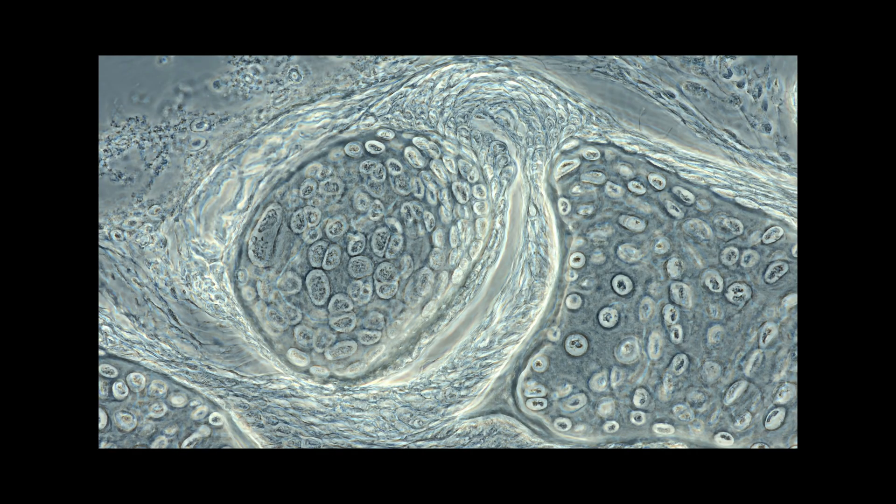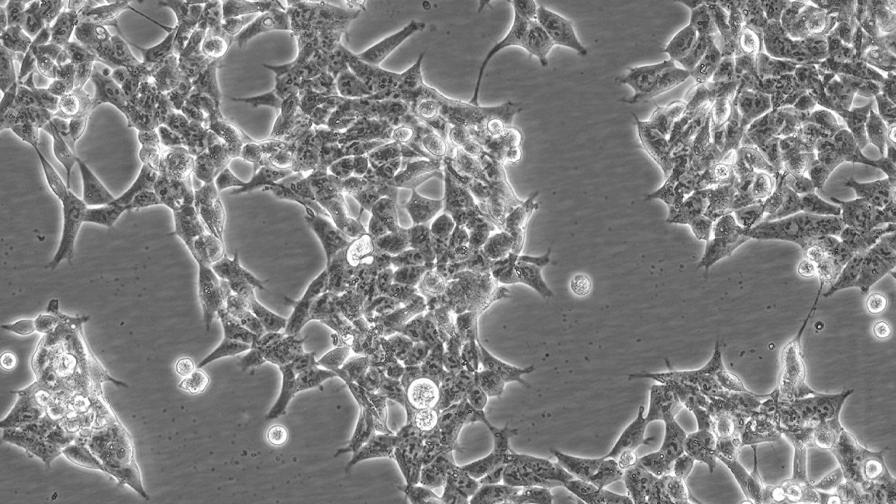Phase contrast microscopy – a method used to observe transparent or semi-transparent objects, unstained pathology sections, sperm, microorganisms and living cells.